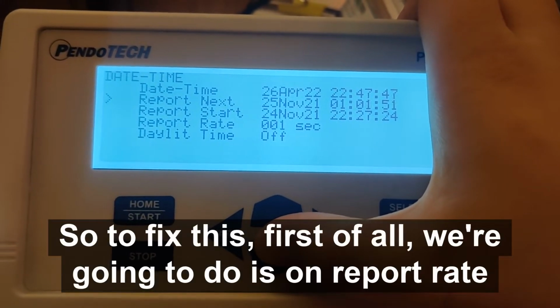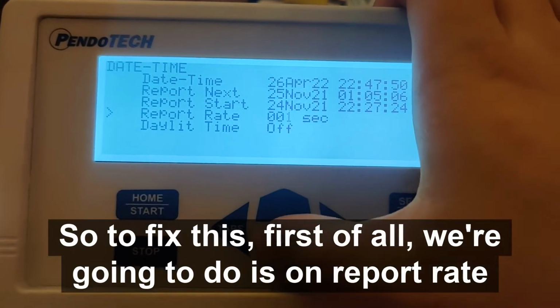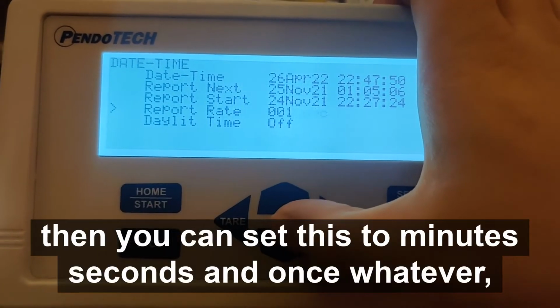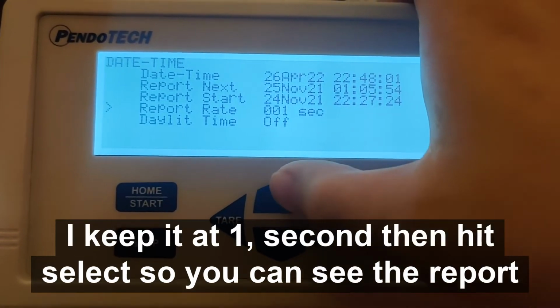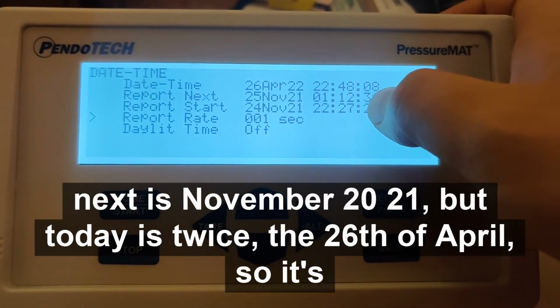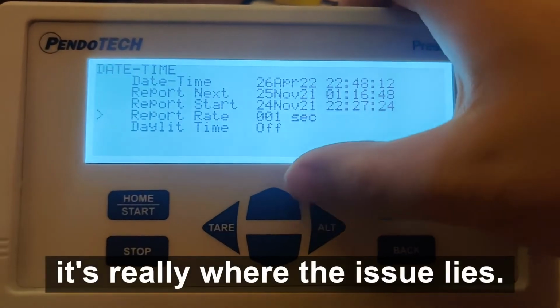So to fix this, first of all, what you're going to do is on report rate, make sure it's at 1 second. So to do that, you just set it to 1 here, and then you scroll over, and then you can set this to minutes, seconds, months, whatever. I keep it at 1 second, then hit select. So you can see the report next is November 2021, but today is the 26th of April, so it's never going to actually hit that. So that's really where the issue lies.